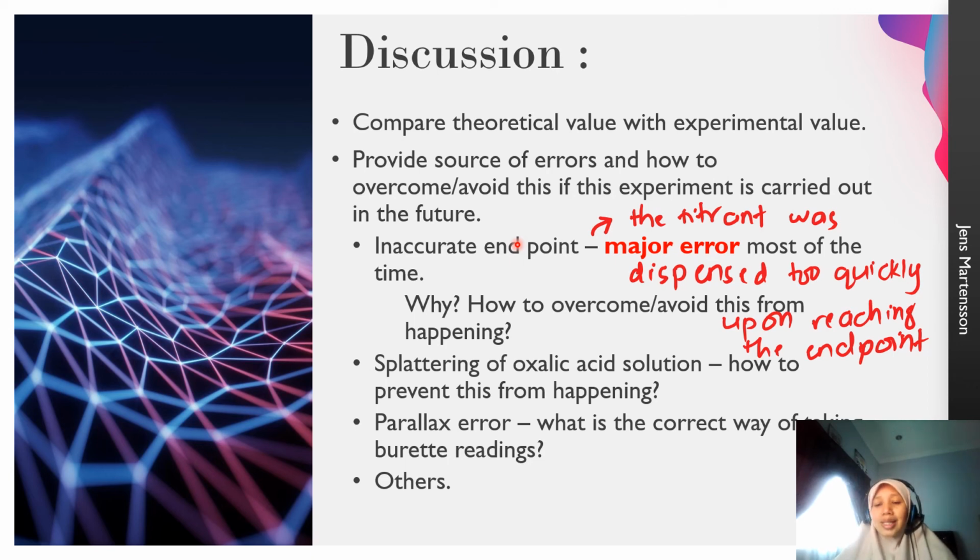The way you write your sentences doesn't matter, as long as you convey the same message. Right? And provide the sources of errors and how to overcome these errors if this is repeated next time. So you report, and you suggest how to make it better. Number 1, this is always the major error done every time by students, that is inaccurate endpoint.